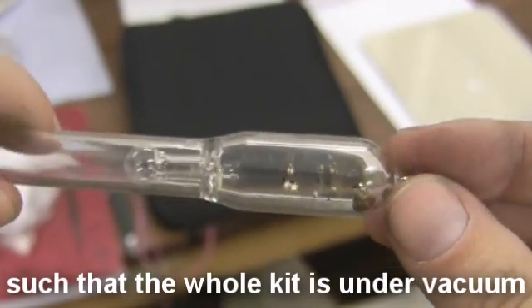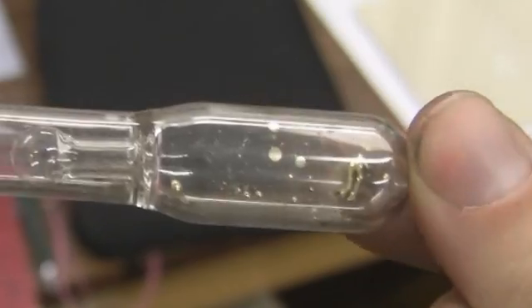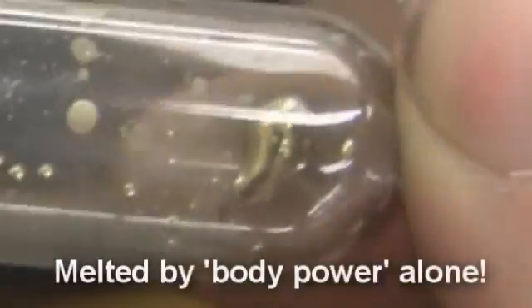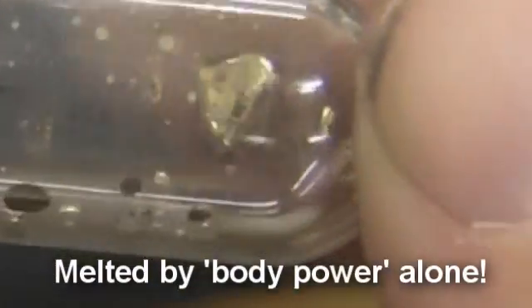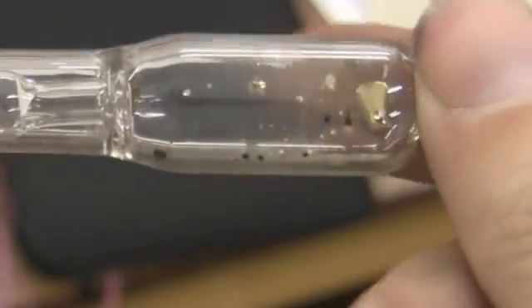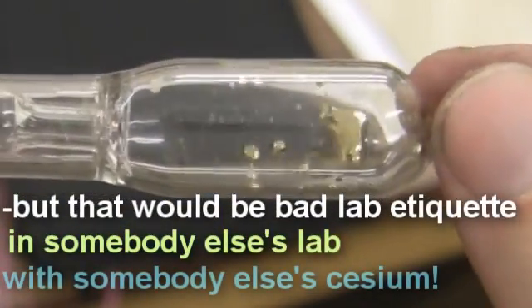The neat thing about cesium is that its melting point is very close to body temperature, such that I should be able to melt it just by rubbing. There it goes — it's now molten cesium, just from the heat of the finger. And if you were to break that seal, this thing would probably smolder and burst into flames in seconds. So anyway, that's molten cesium.